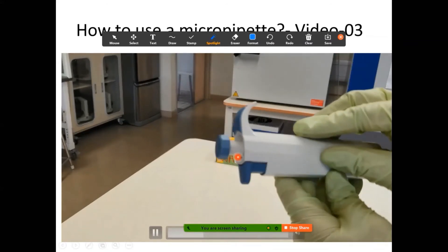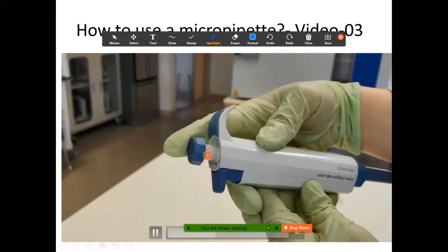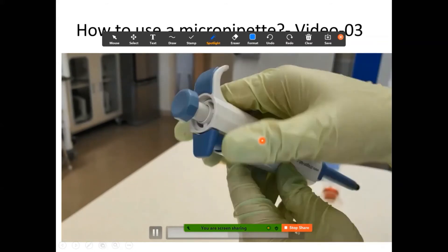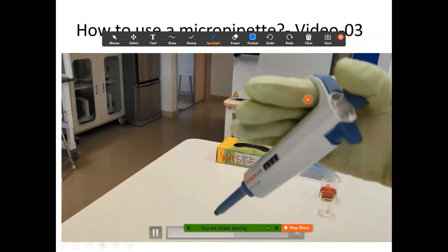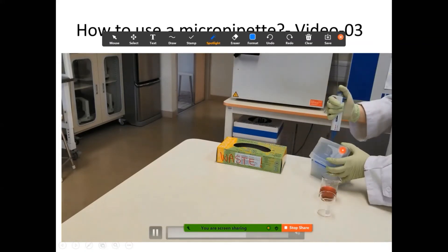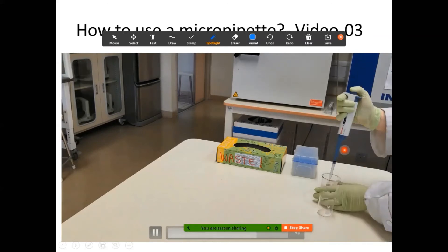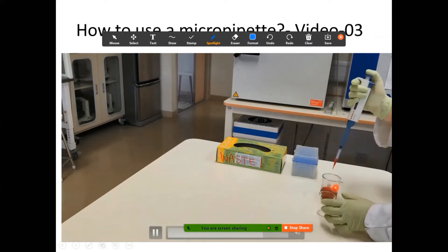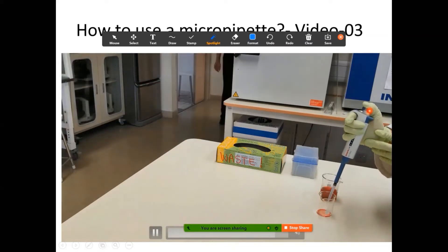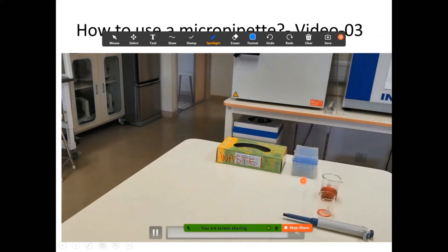There's another button to remove the tip. So: first stop is to extract fluid, the other button removes the tip, and the second stop removes excess fluid from the tip. Use the hook to hold it around the base of your index finger. You must use a micropipette tip to prevent cross-contamination. Press to the first stop, dip it into the solution, make sure it's fully submerged, then slowly release. Press to the second stop to remove excess, then use the other button to remove the tip.